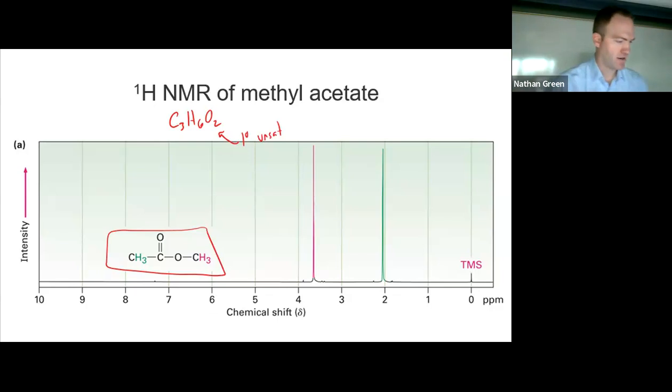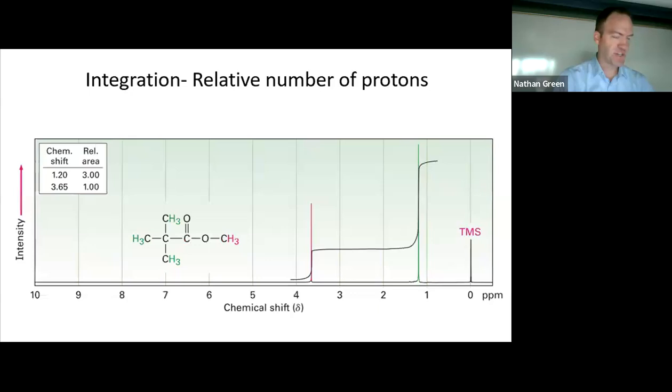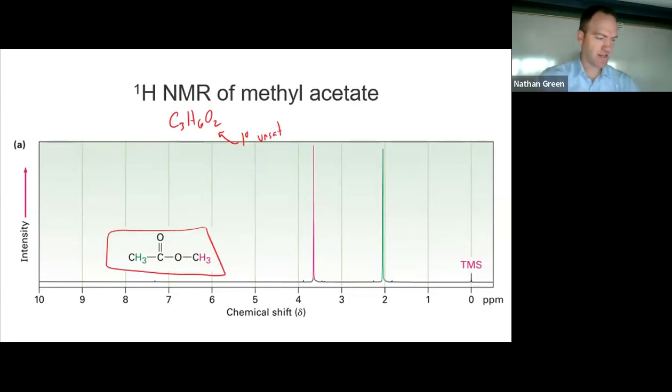So we'll get to that here in a second, but sorry, that's probably not super helpful unless you are steeped in Plato, in which case you should check out Plato. It's pretty cool. That is chemical shift. That is the x-axis here. Things that are electron rich are on the right. Things that are electron poor are on the left.